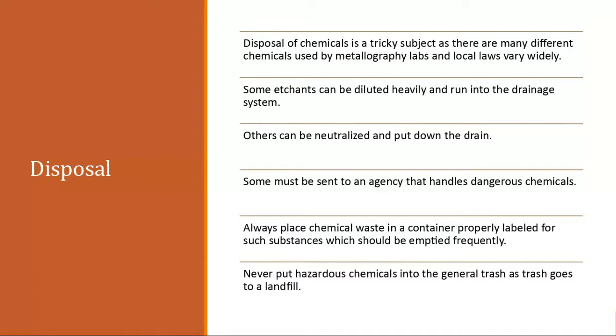Just disposal wise though, some of these etchants, there are different ways you can dispose of them. Some etchants can be diluted very heavily and just dumped down the drain. Unfortunately, that is not how we do things in the lab. We will typically neutralize the solution, and then we can put it in a waste container.